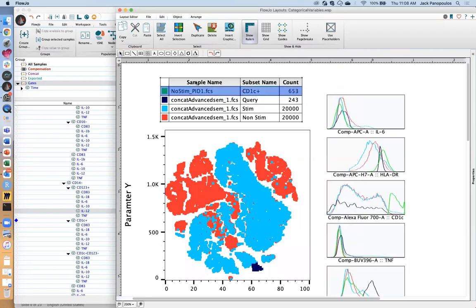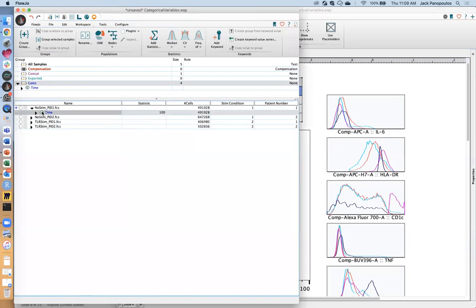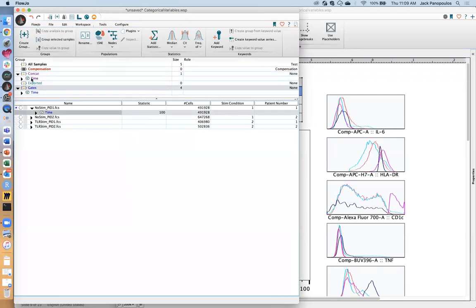And I probably should pick another color, because there might be people that are a little bit colorblind that way. So let's choose pink. Interesting. So it updated my line trace, but I don't think it's updated my t-SNE plot. Oh, I know why, because I'm pulling this from another sample. So it shouldn't do that. Anyway, my mistake. I need to really transfer these gates onto the concatenated file to see where they map to. So let's go ahead and drag this right onto the concatenated file.